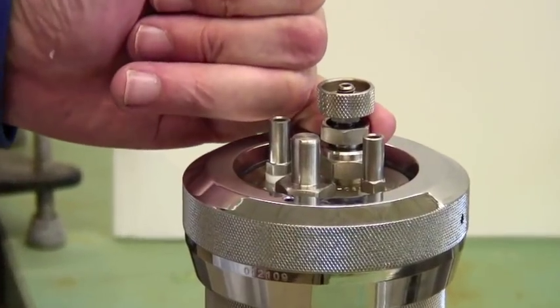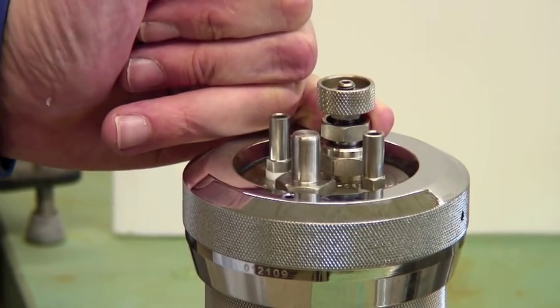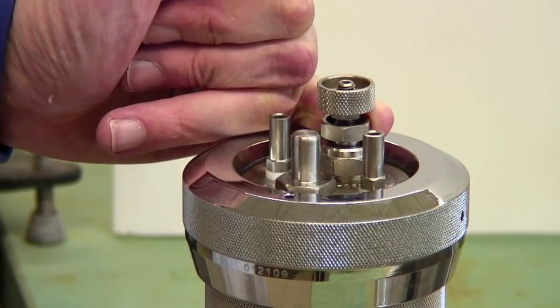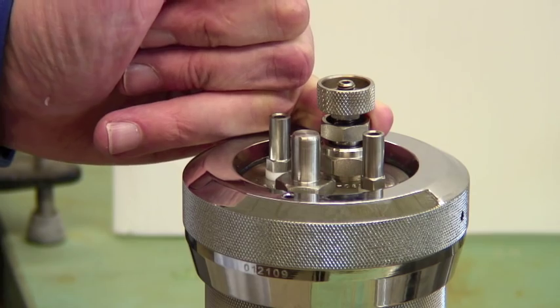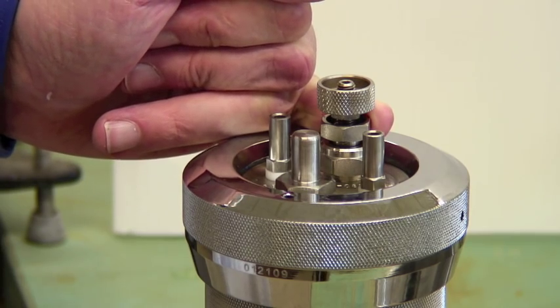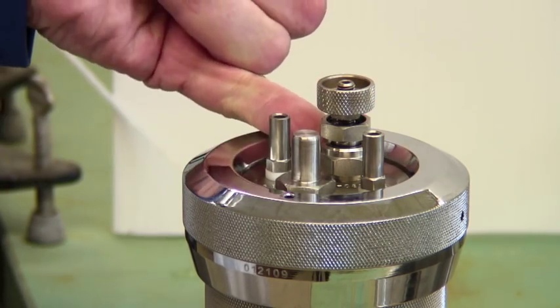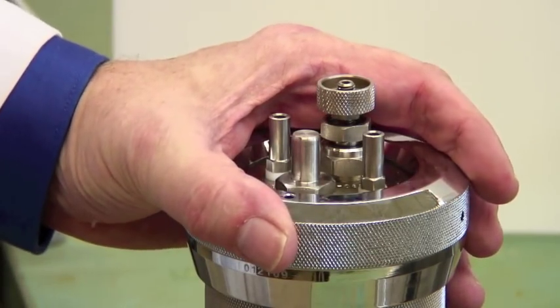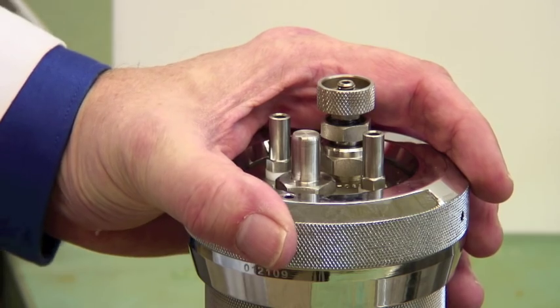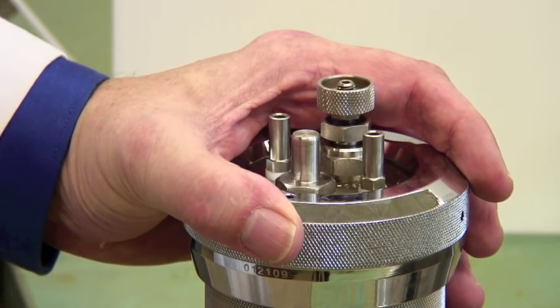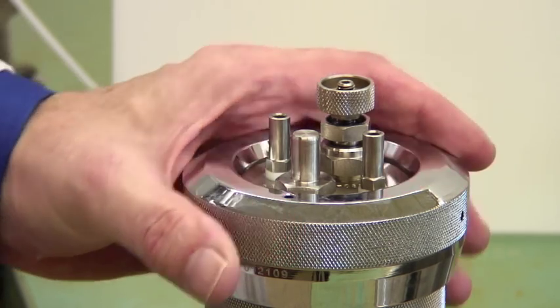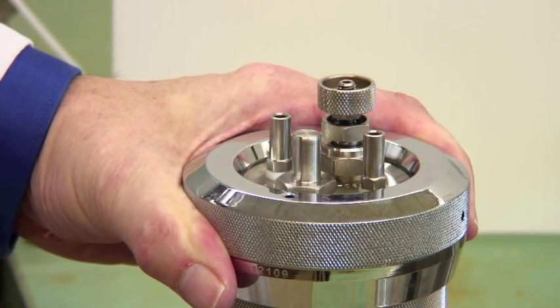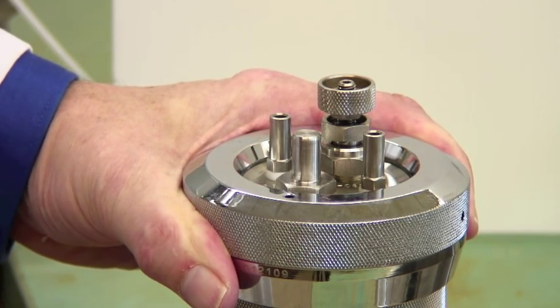Inside the release valve is also a rupture disc. So if for some reason the pressure inside the bomb gets up to about 45, 50 atmospheres, it will blow. It's designed that it will go first rather than having the entire bomb blow, which would be much more damaging. But for that reason, there is an upper limit on the safe pressure in this bomb. We never charge it more than 20 atmospheres.